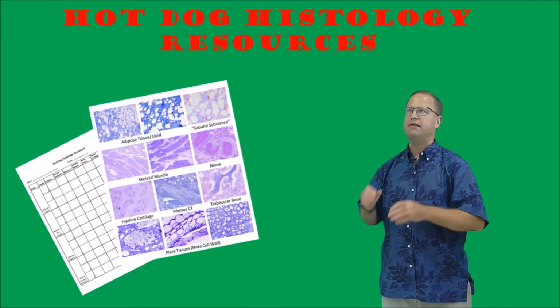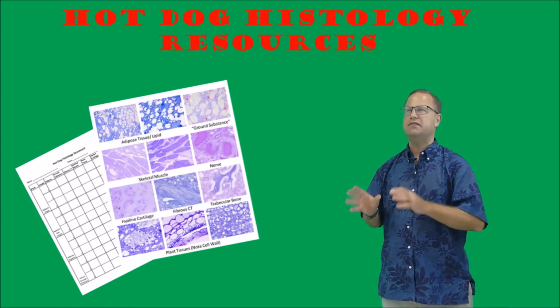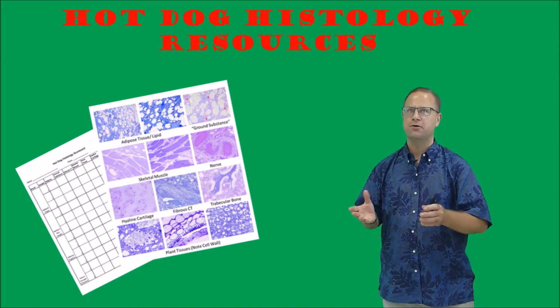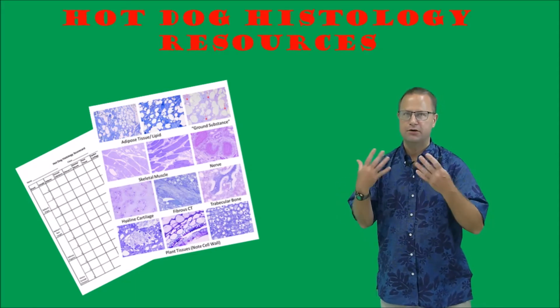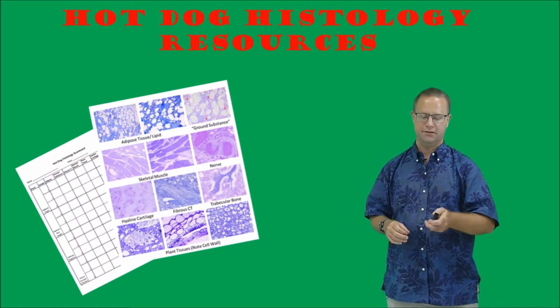We also have a histology cheat sheet, and this cheat sheet is very important because a lot of the tissues that you're going to see in these hot dogs don't look like the tissues you see under the microscope. These hot dogs have, after all, been cooked, chopped up and macerated, and so the tissues are going to look somewhat different.